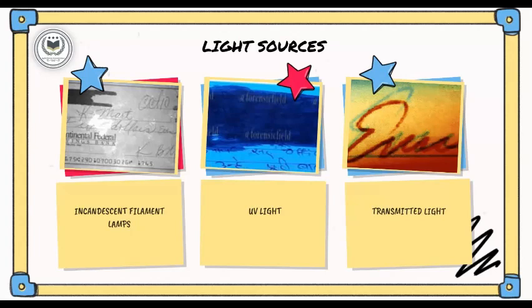The VSC offers three varieties of UV light. This is with 365 nanometers UVA, 312 nanometers UVB, and 254 nanometers UVC peak wavelengths. They use narrow band illumination to trigger fluorescence.